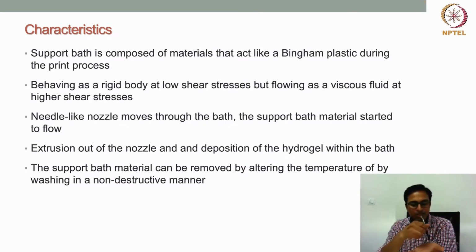Again, when the nozzle moves away, the support bath material comes back to its original position and encapsulates the bioprinted structure, or bioprinted line, of any shape or size. Again it will be like a solid structure, so it can provide support to the deposited material. So that's what happens in the case of 3D printing in a support bath.